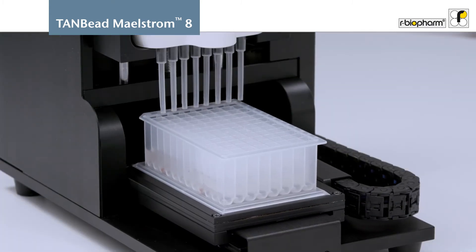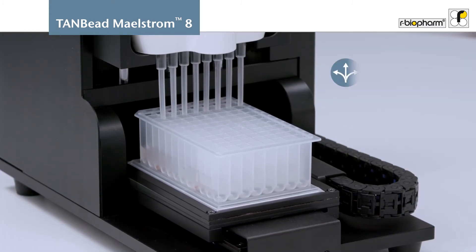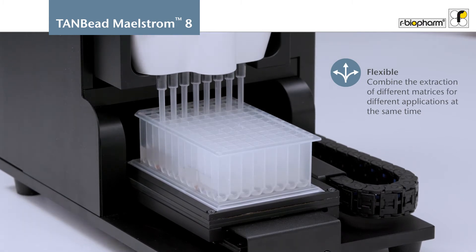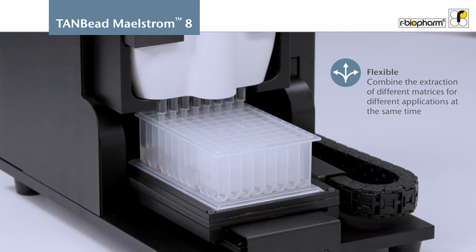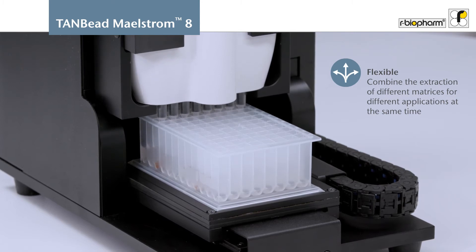This semi-automated solution enables almost hands-free DNA and RNA extraction, with the option to combine extractions of different applications and matrices at the same time, and easily integrates into any laboratory workflow.